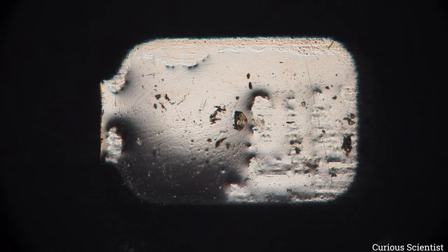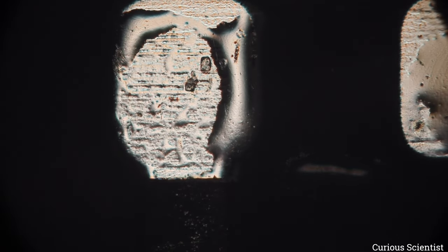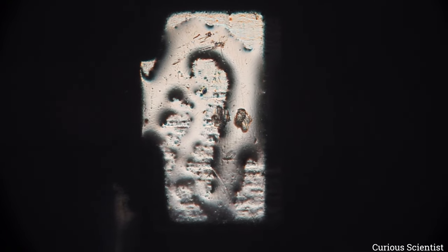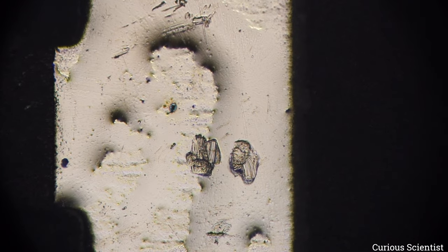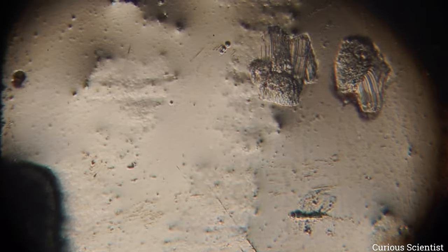This object is an SMD component solder pad. You can see it is coated with something and appears three-dimensional. Those puddles or splatters are actually lead-tin from the PCB manufacturing process. The PCB is in its as-received state — I haven't touched it — so you can see the pads in their original condition, with nicely visible topography showing how the lead-tin is covering the tab.